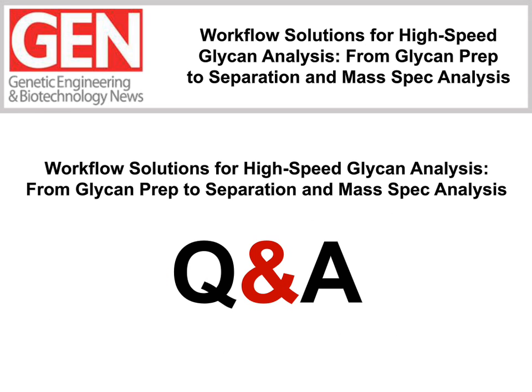Yes, there are a few different approaches. One is to do the assignment based on retention time. The simplest way to do this is to purchase a standard. So if you think that the glycan is, for example, the G0F, you can purchase that glycan from a company like Prozyme and do an injection and see if the retention time matches up.